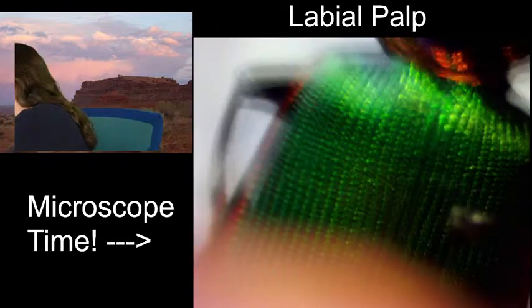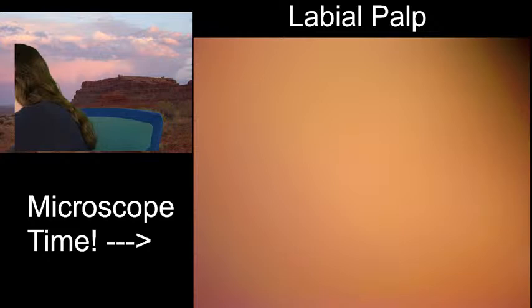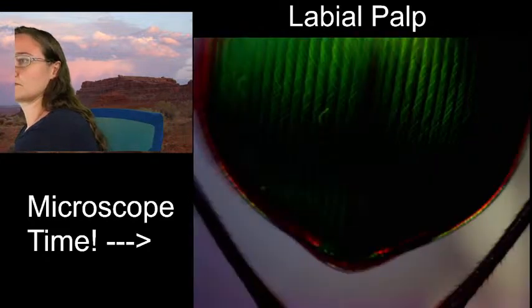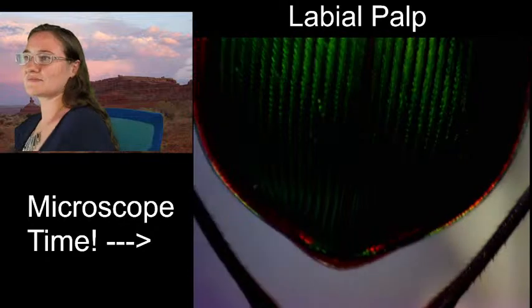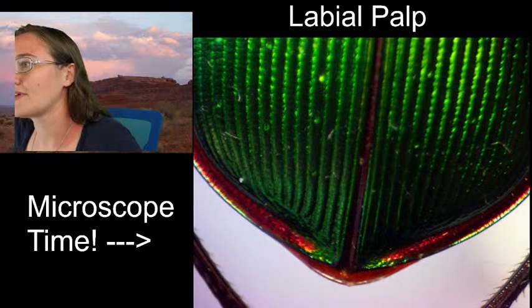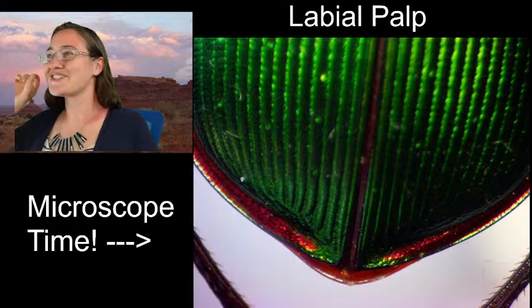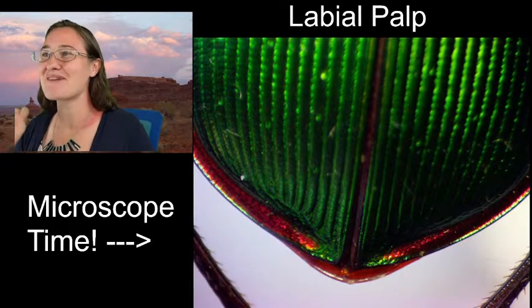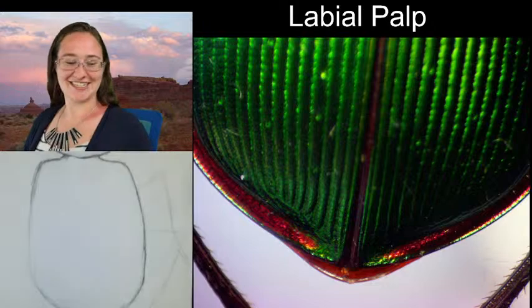Looks like I'm going to have to angle my specimen one more time. It's just gorgeous. I just love them so much.